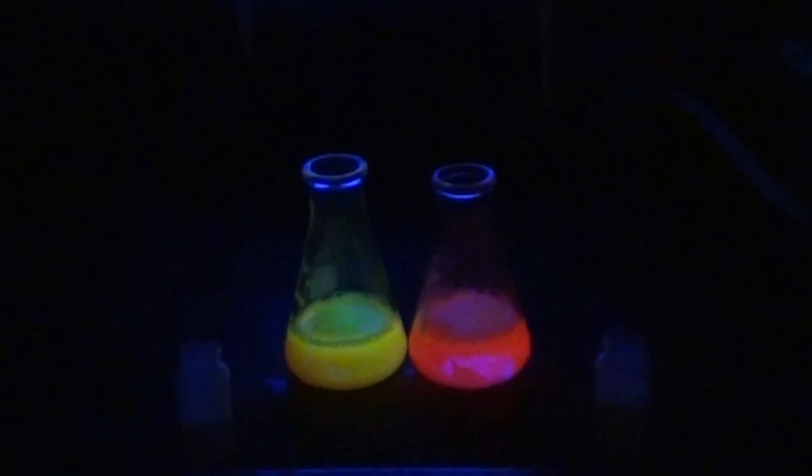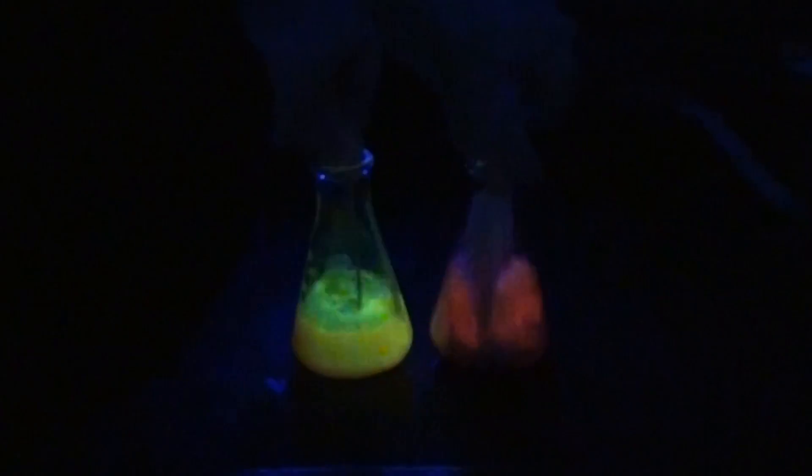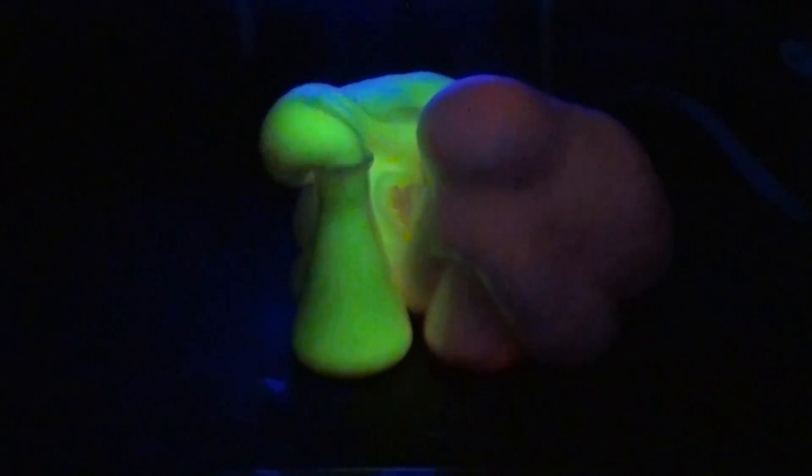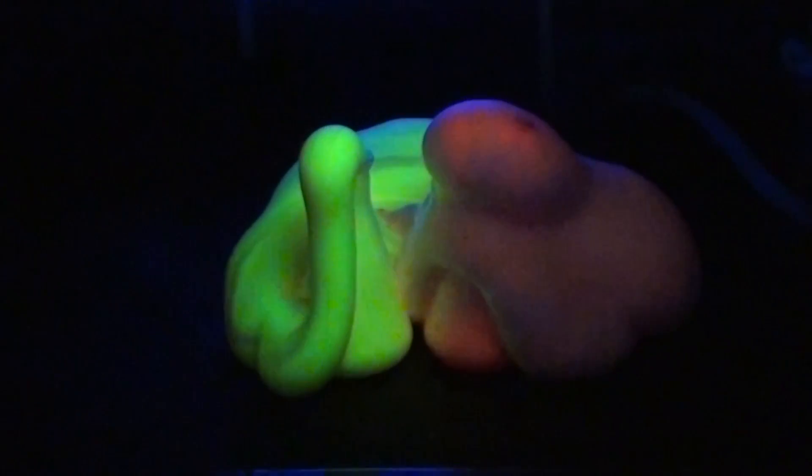Now we get the ultraviolet light and let them fluoresce. Here it goes with the yeast. And that is glowing elephant toothpaste. It's not as fast as iodide, but it works.